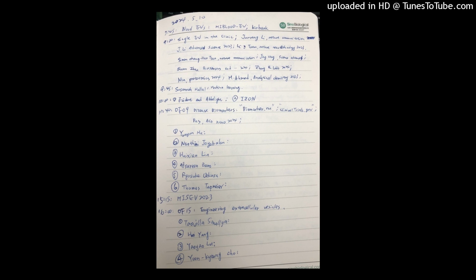And when we compare the FTIR transmission among the non-smoker and smoker groups, we found significant results. And then we compare the relative intensity ratio of the FTIR transmittance, and we again found a significant difference between the smoker and the non-smoker group. It means it has the potential to discriminate between these two groups.